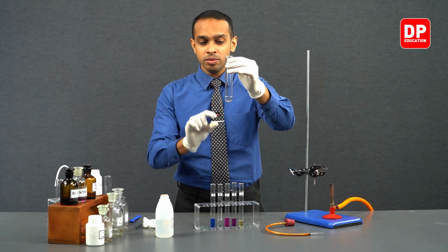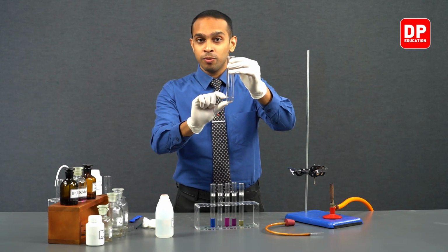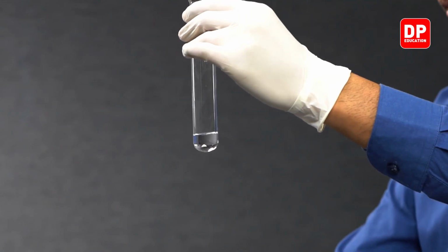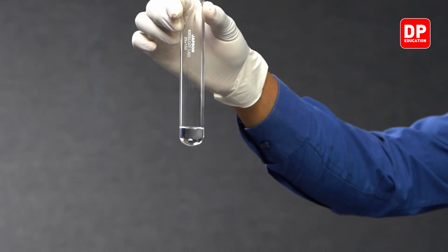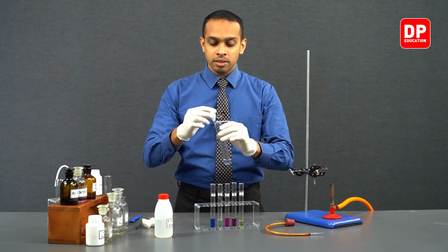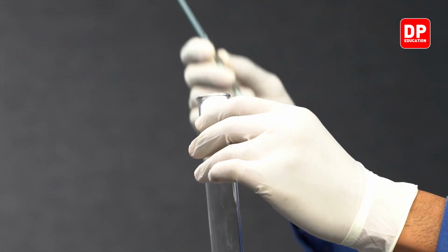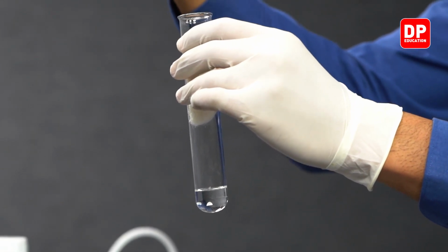We have added ethanol into this boiling tube, and the ethanol level is about 2 centimeters from the bottom of our boiling tube. So after adding ethanol into the boiling tube, the next step would require us to add some cotton wool. So you can take about 2 pieces of cotton wool, and we can push it towards the bottom of the boiling tube with the help of a glass rod.